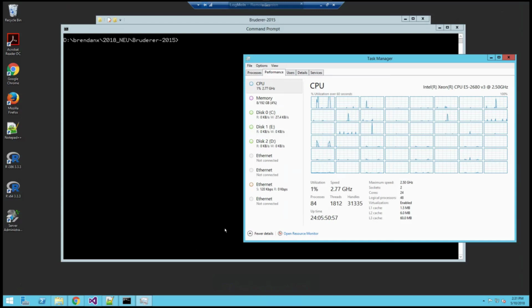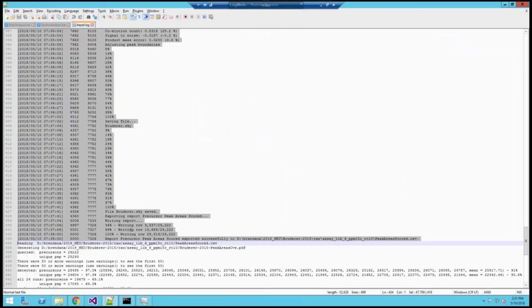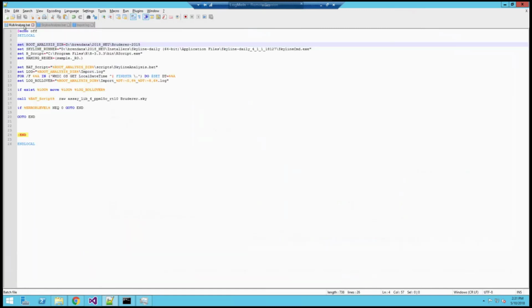Well, it's actually running a little bit, the gigahertz is running a little bit slower. So that is kind of surprising, that if you don't get enough parallelism going on this computer, it can actually be slower than my desktop. So it's really important that we do things massively parallel on this computer, but we can do things massively parallel. And so what I'm going to show you is these are the scripts that you have now. Each one of our pubs data folders has a scripts folder.